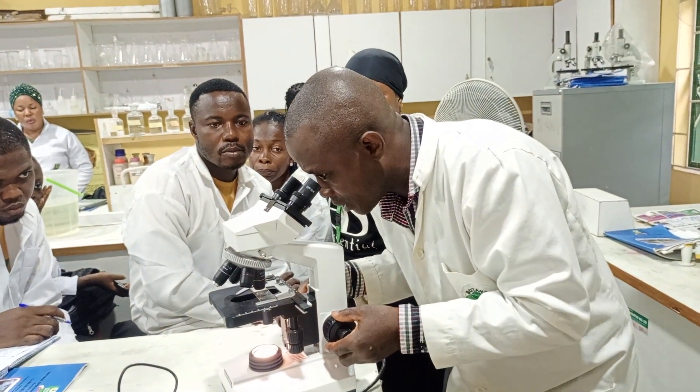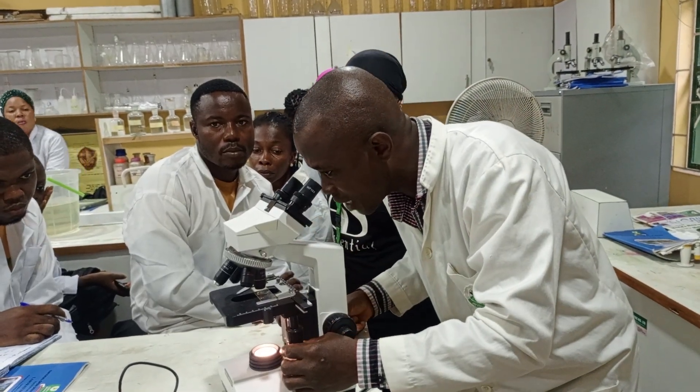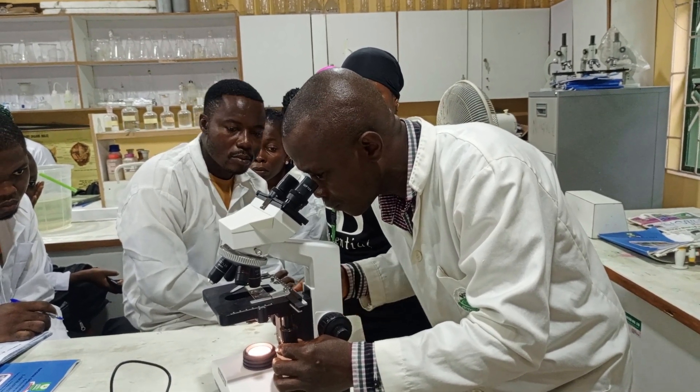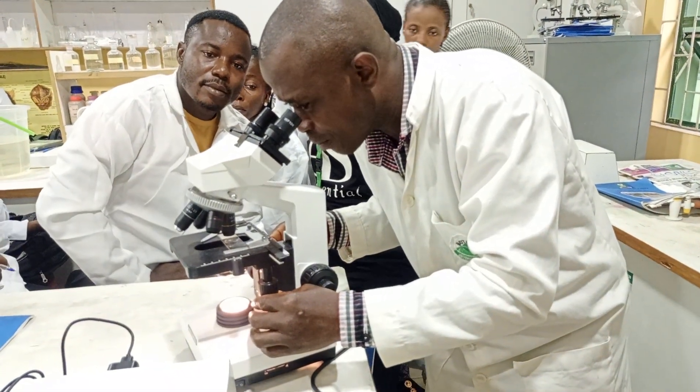As you move the knob very gently, you will see your specimen. If it's not well positioned, use the stage adjustment knob to move it to where you want. Then you have your specimen in view.